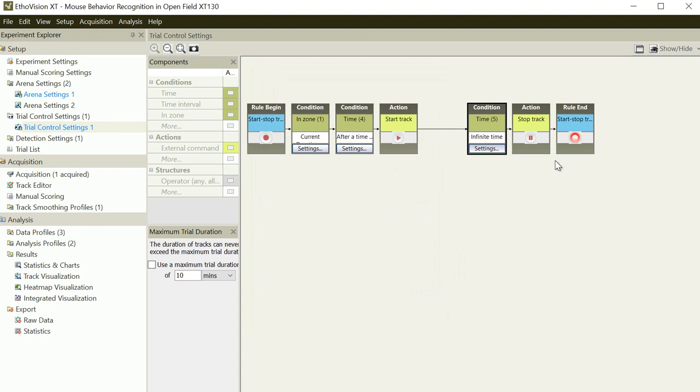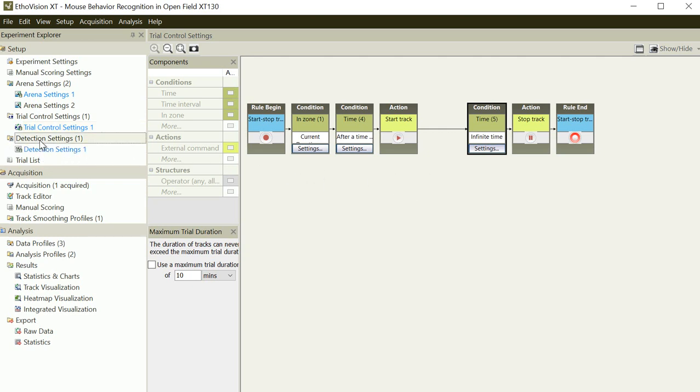And you can also synchronize your external devices like a pellet dispenser or liquimator, or a lighting system, or some other stimulating system. When you try to synchronize those external devices, you can make an algorithm for when your device will start. This is a quite complex story, so we will skip it for now.